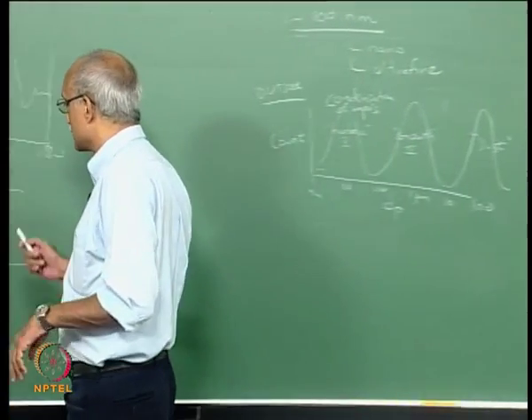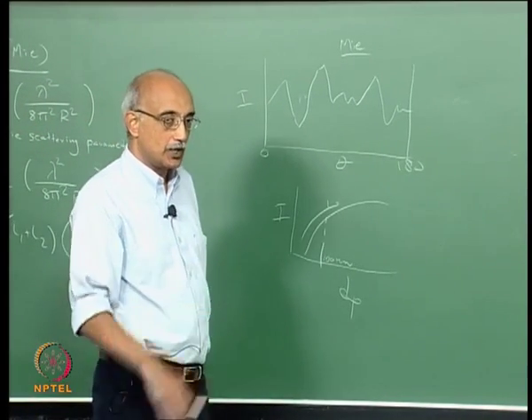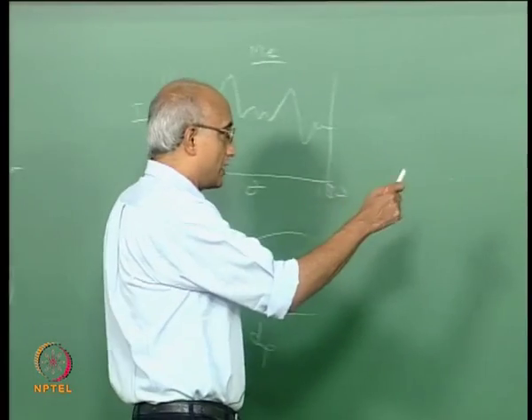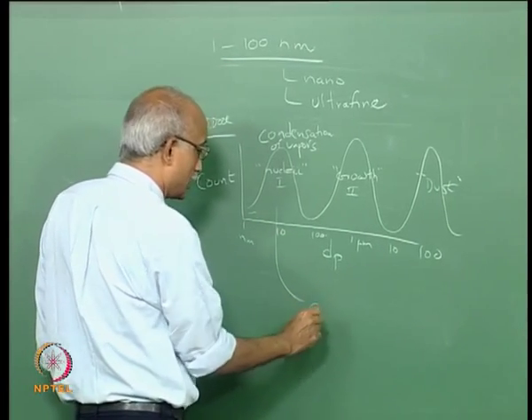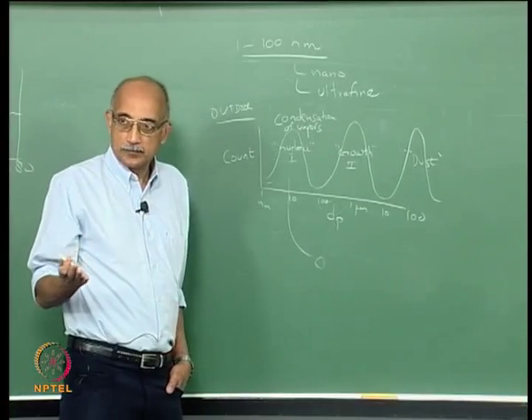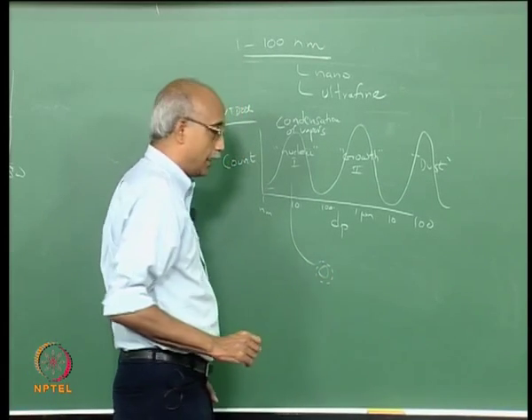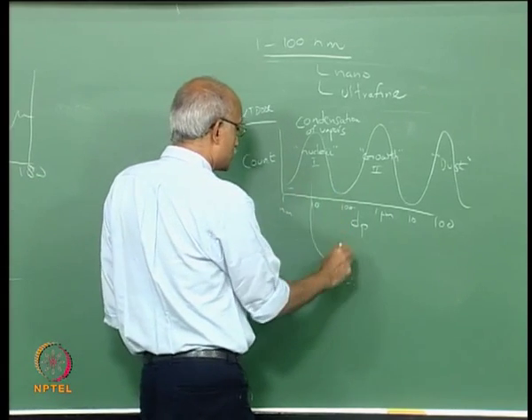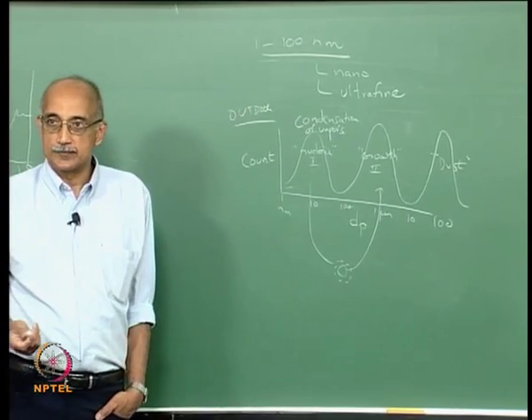Given that there is this steep fall in scattering intensity as the size drops below 100 nanometers, how do you measure it? Well, going back to these curves, essentially what we try to do is, if you are trying to measure the size of a particle in this size range, you introduce a vapor which condenses on top of this particle and grows a sufficiently thick layer so that this particle size is migrated from this range to a more measurable range.